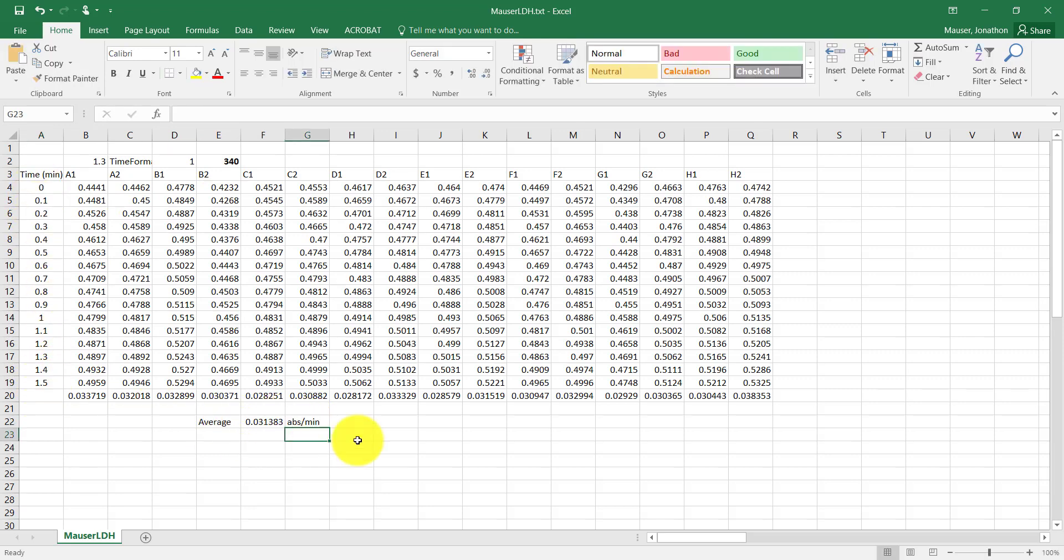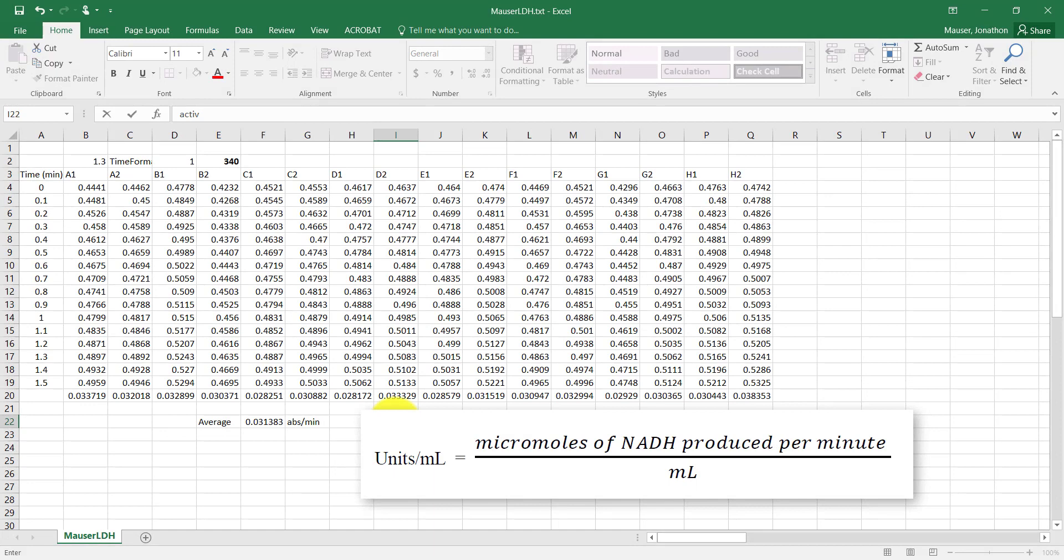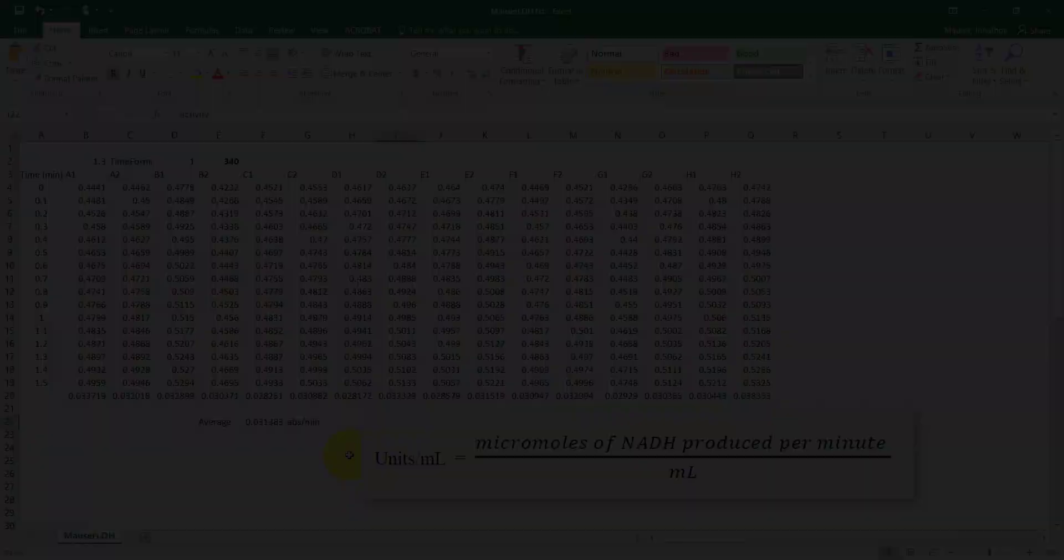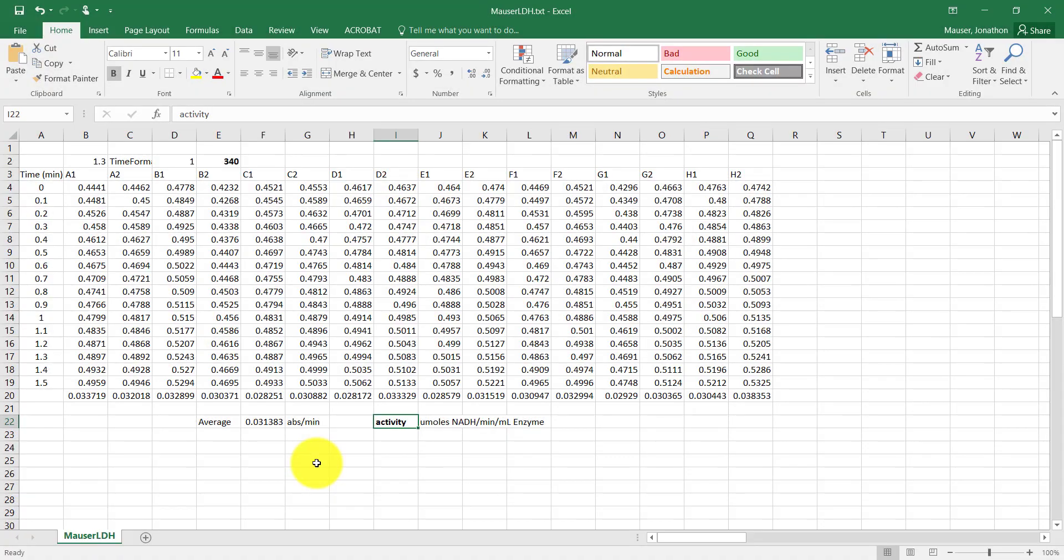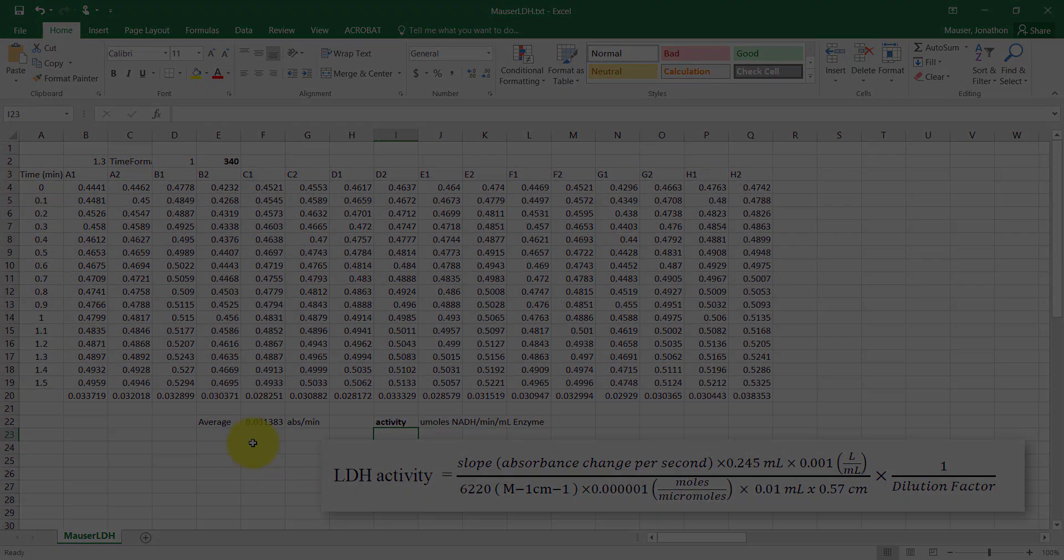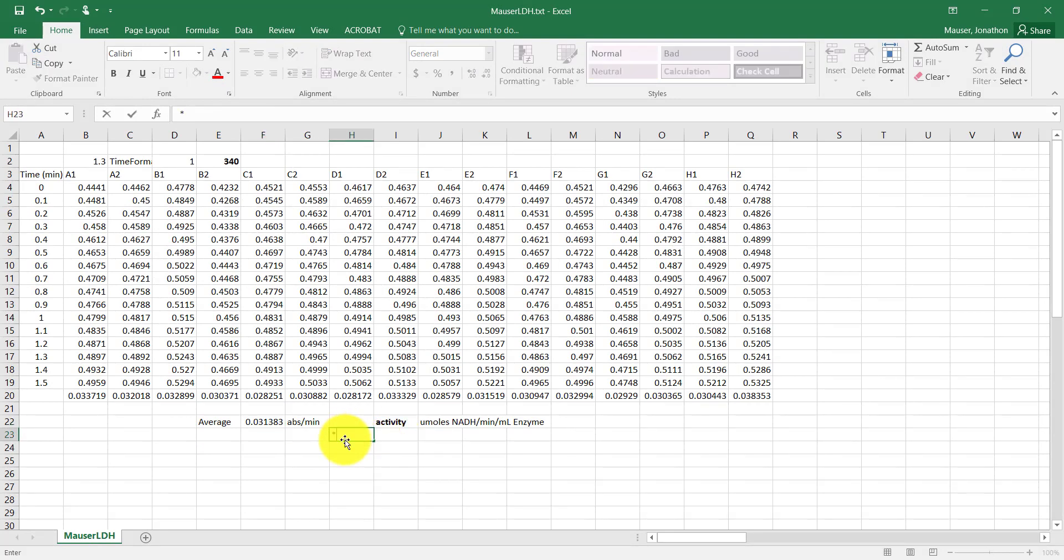Our unit for activity is micromoles of NADH per minute per mil of enzyme. So that's our activity unit. So we need to do some conversions. Luckily for us, this conversion factor exists. And if we want to convert between our average here, just our average slope, and our activity, all you have to do is multiply by 6.9 and by 1 over your dilution factor.